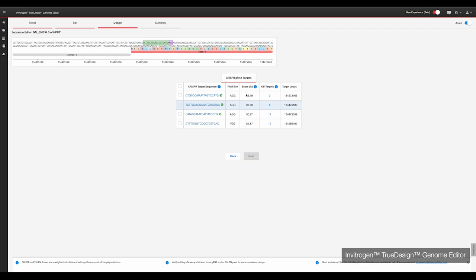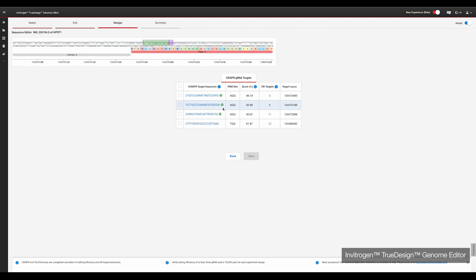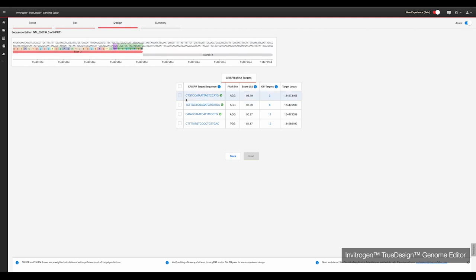Clicking the off-target number gives you a list of the possible off-target editing sites. However, just because an off-target is listed, it does not guarantee the edit will occur, especially if your gRNA has a high performance score. Overall, a gRNA with a high score and a low off-target number is ideal. True Design will add green checkmarks to the top gRNAs it has identified. We recommend trying two or three gRNAs for each new gene target you're editing.